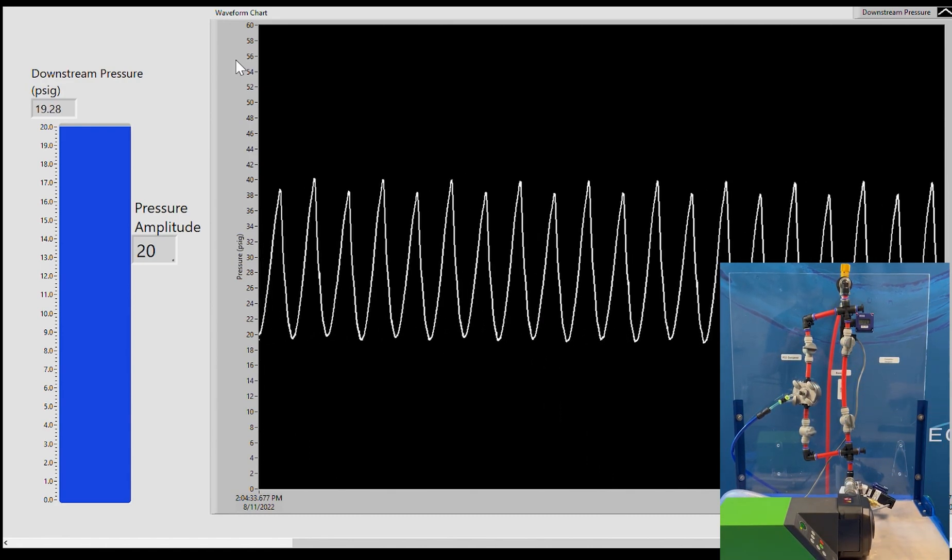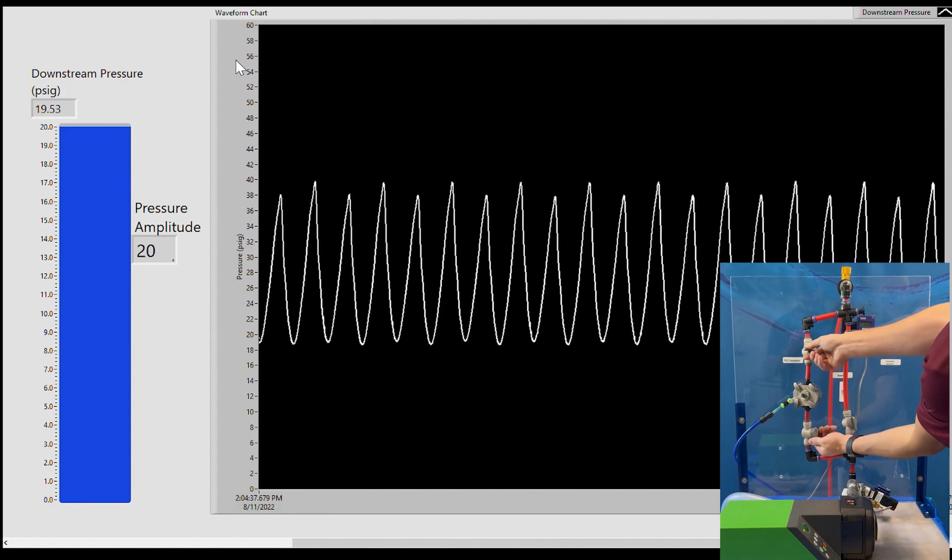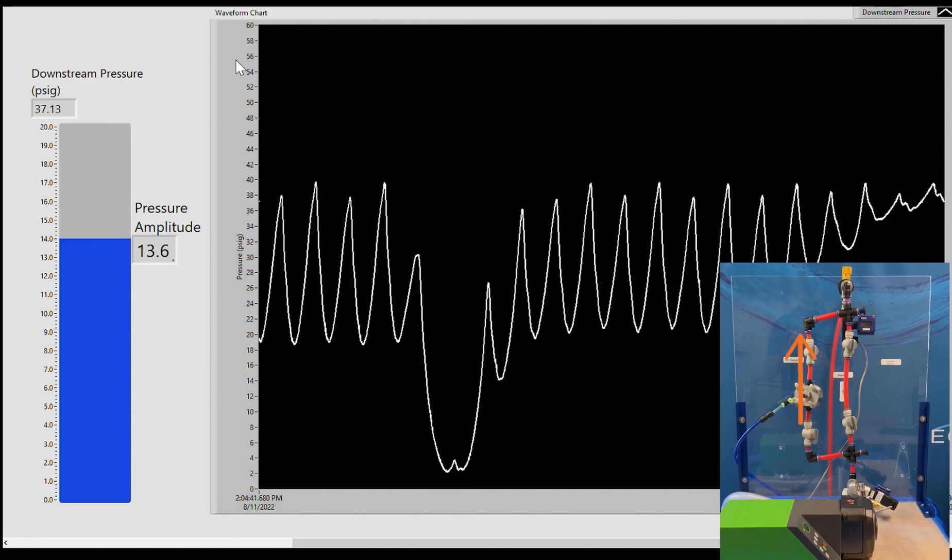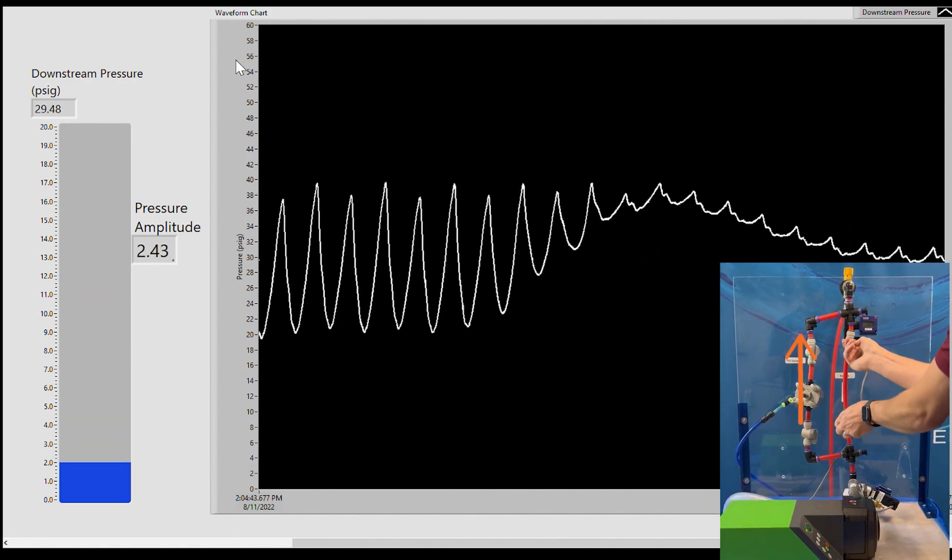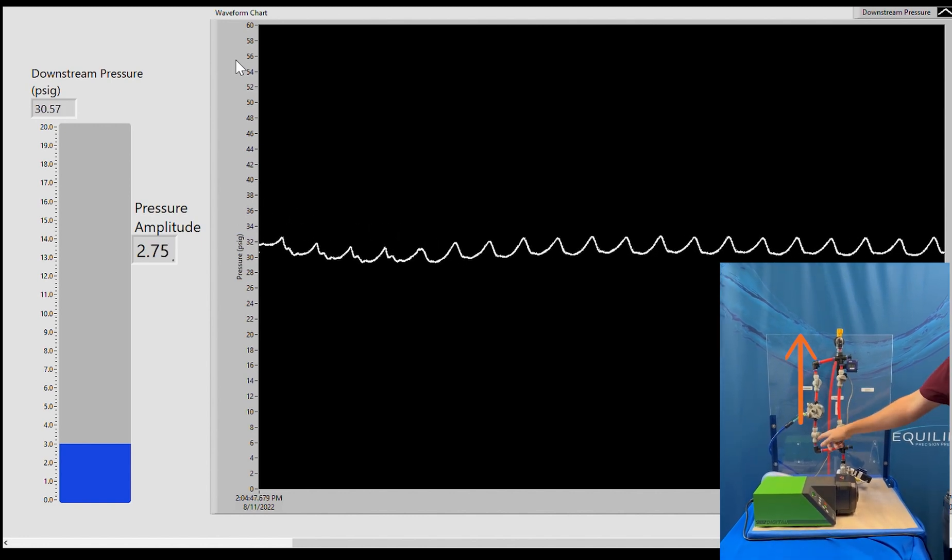We'll now move over to what the Equilibar can do to dampen that pulsation. Now that the flow is diverted from the base case to the Equilibar case.